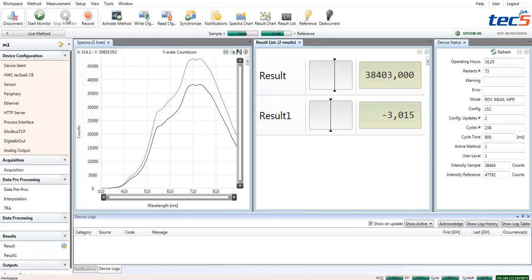The MPT user may log out, close the application software and remove the PC. The measurement system autonomously continues its operation.